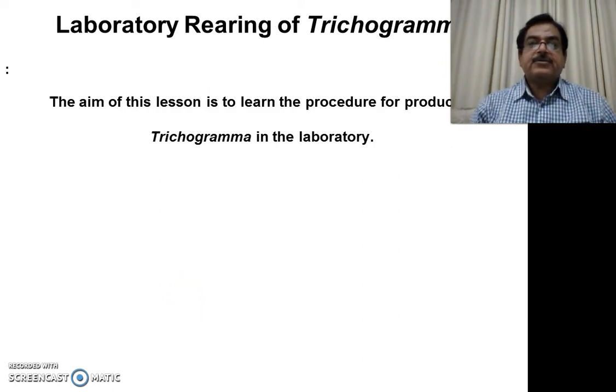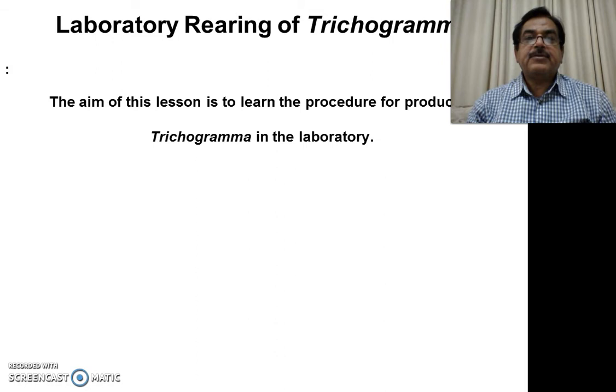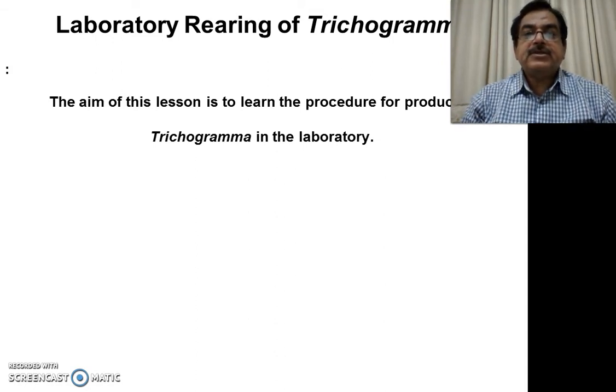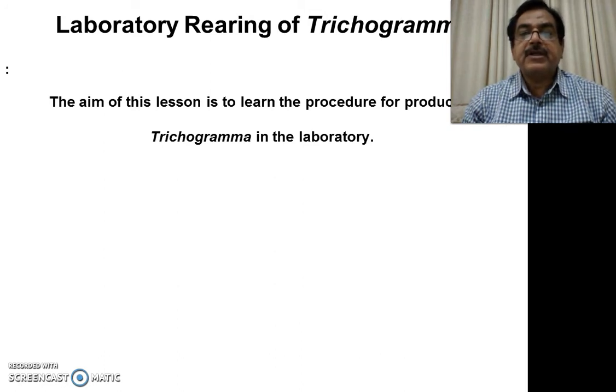Bismillahirrahmanirrahim. Dear students, our today's lecture is about laboratory rearing of Trichogramma. The aim of this lesson is to learn the procedure for production of Trichogramma in the laboratory.